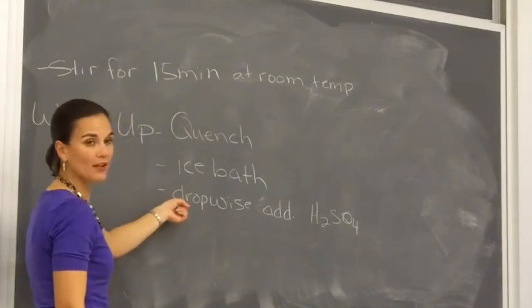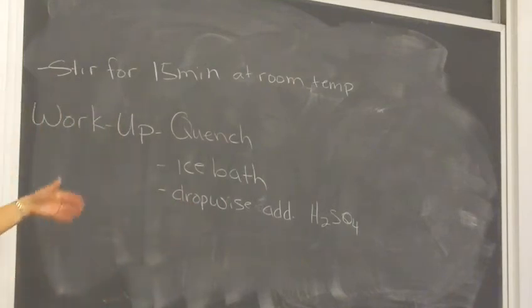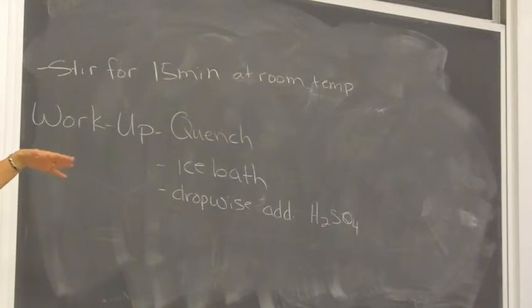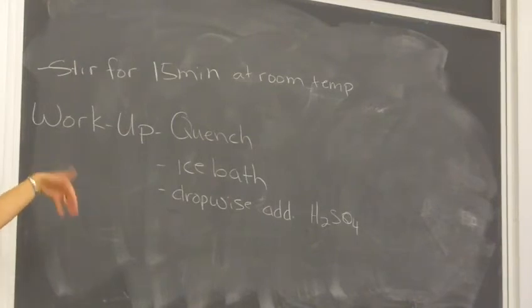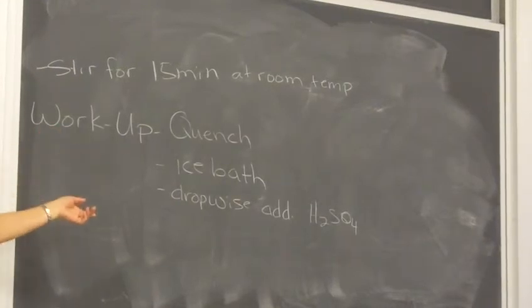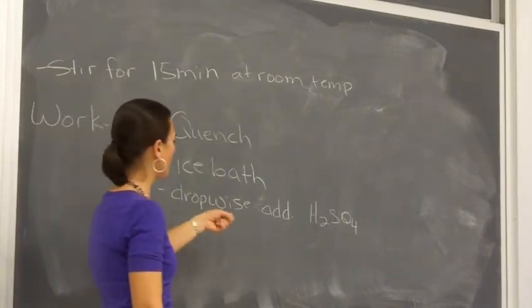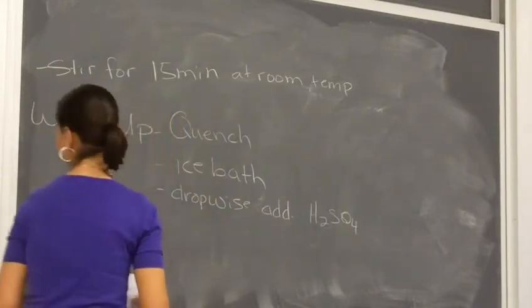And like I said, you're controlling temperature here. Now, one thing you may see is, I'm going to go through here in a minute, the different reactions that are going on during this quench. One of the things it's doing is it's basically killing or reacting any unused magnesium way back from the Grignard reagent. So you'll see magnesium spinning around and then bubbles coming off of that magnesium, and that's okay, all right? That's part of what's supposed to happen. But make sure you really control the heat with that addition.